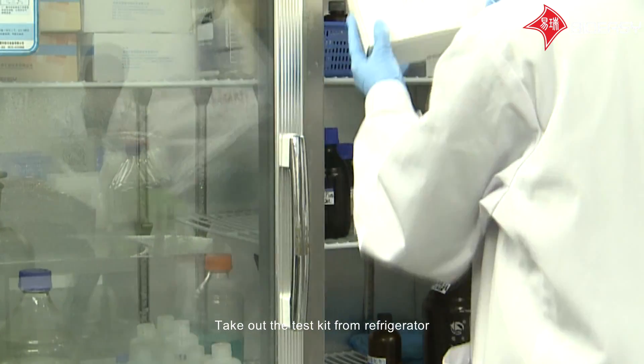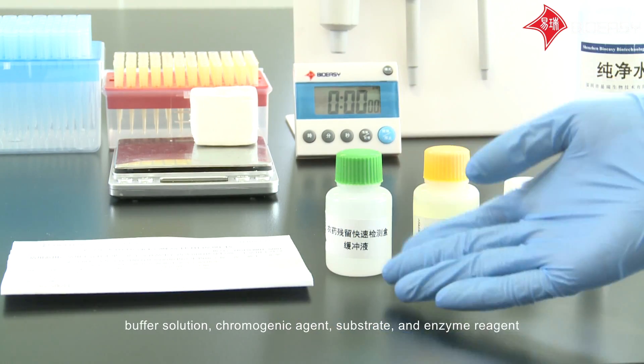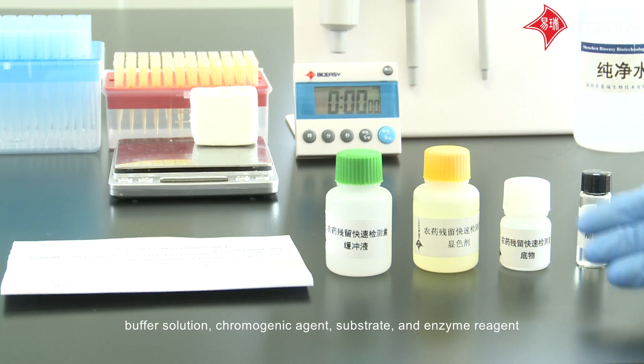Take out the test kit from the refrigerator. The Pesticide Residue Rapid Test Kit consists of a manual, buffer solution, chromogenic agent, substrate, and enzyme reagent.